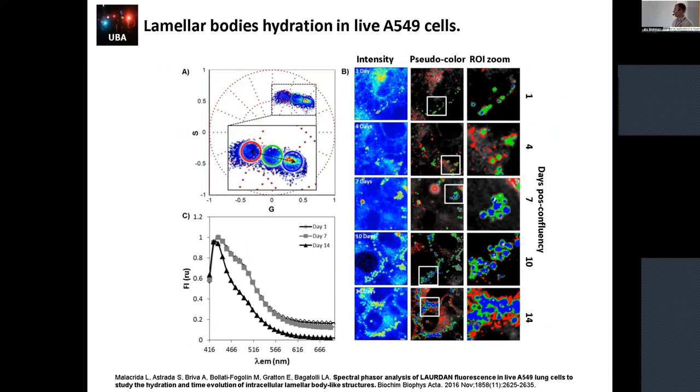So the first question that we have is, okay, well, of course, if they grow in size, we will have a higher number of pixels which are blue, right? But can we correlate size and lipid organization? Maybe we can capture something else.